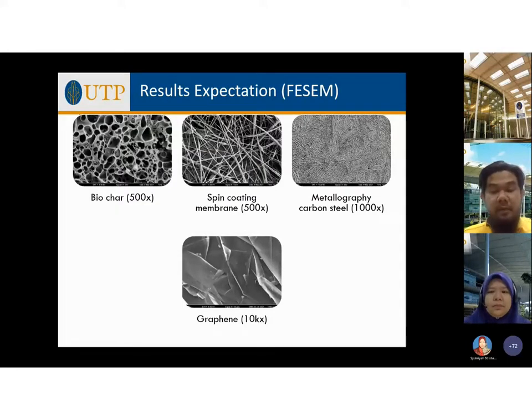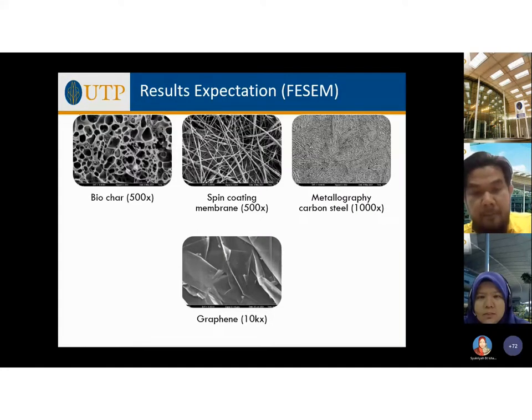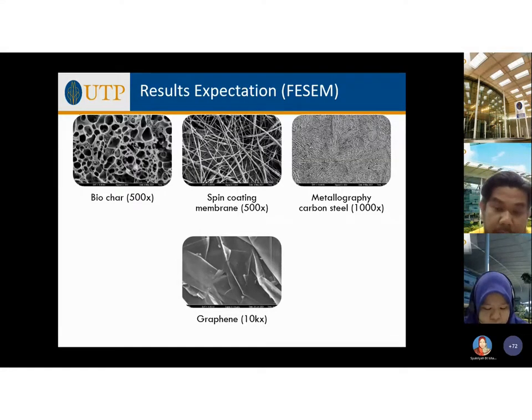Before we get this sample, you have to do some processing, which is mounting the sample, grinding the sample, polishing until you get a mirror finish, and then you do the etching process with the etching chemical. And then after that you analyze under the microscope. We can also run it under a light microscope, and then we can see an image like this.